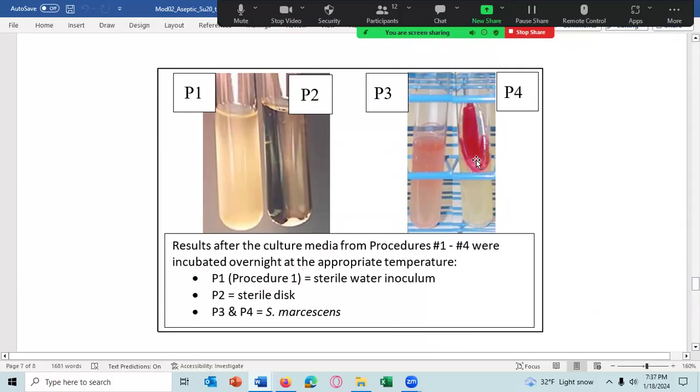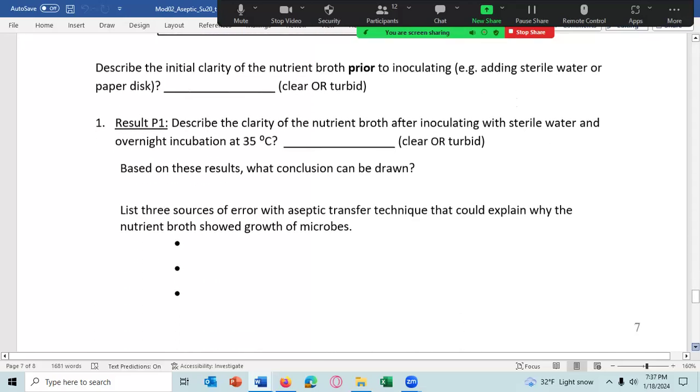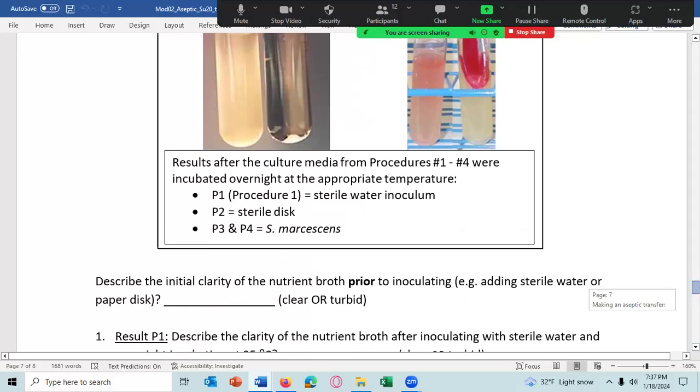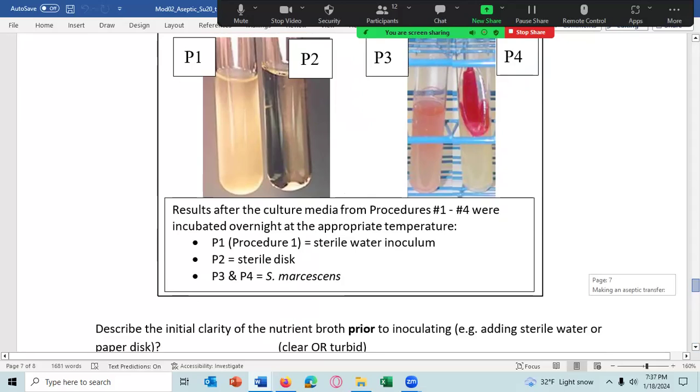And there it is there. The bacteria has the correct color, so it looks like it's the correct species. And it looks everywhere the same. I guess I should mention a little bit there. Right here, it's a little bit lighter, but that's because there's some water in the bottom of the tube in the slant.